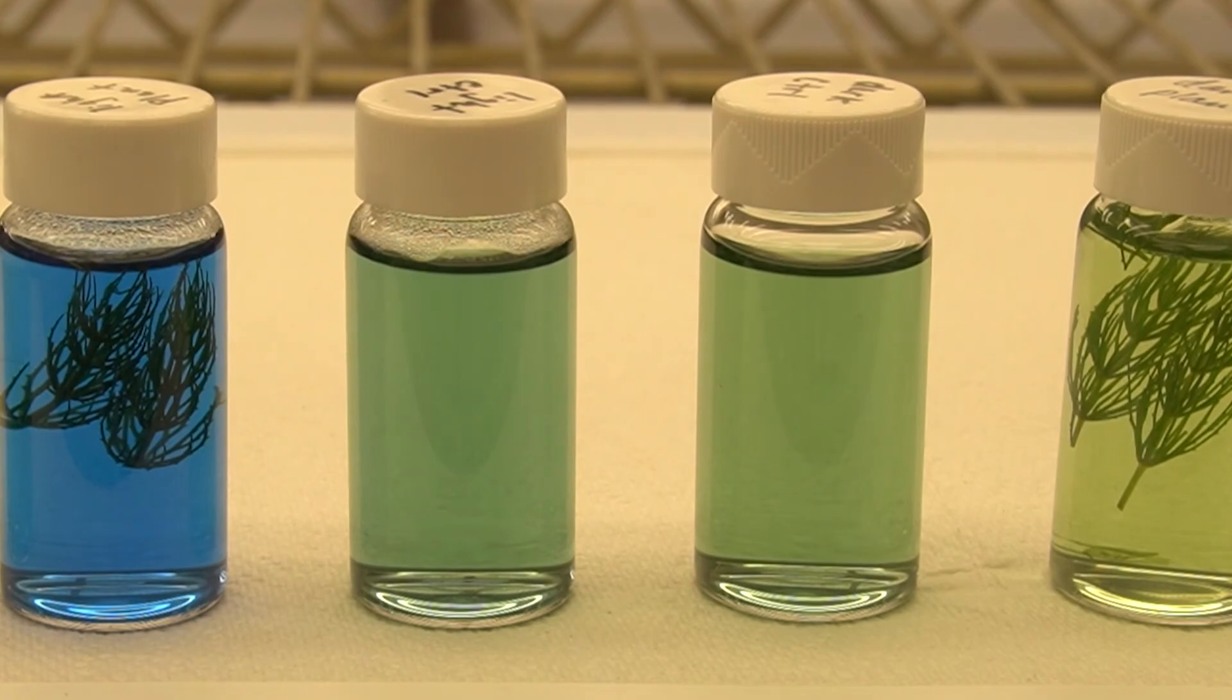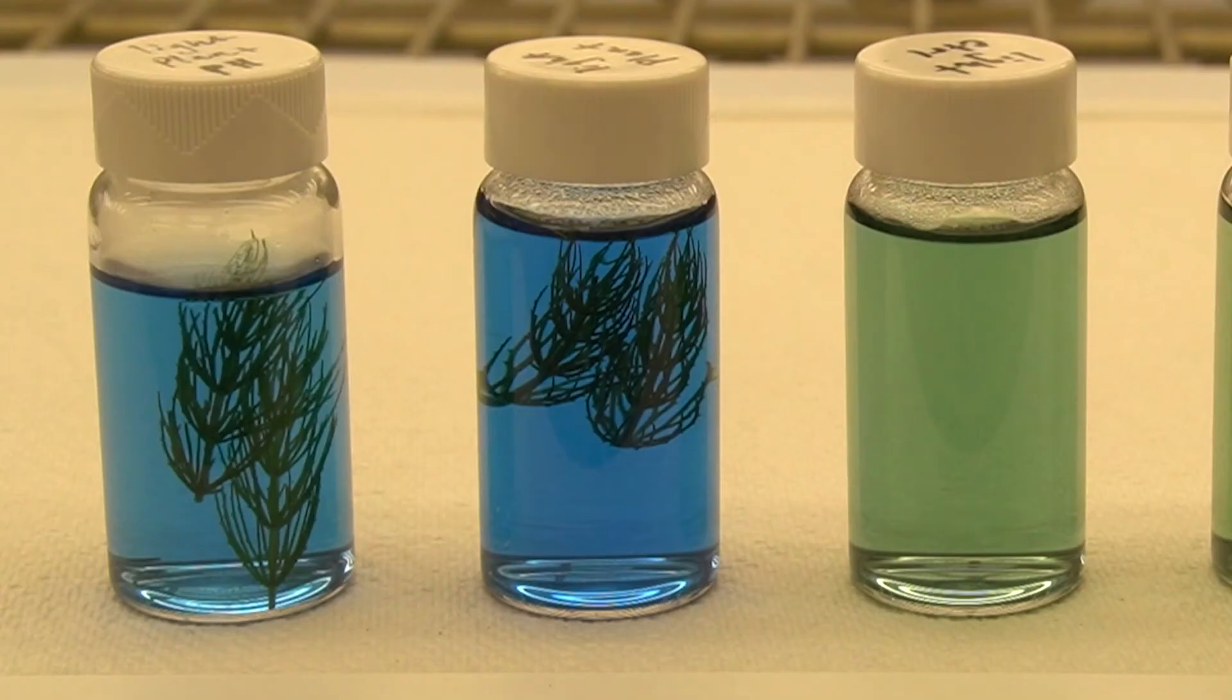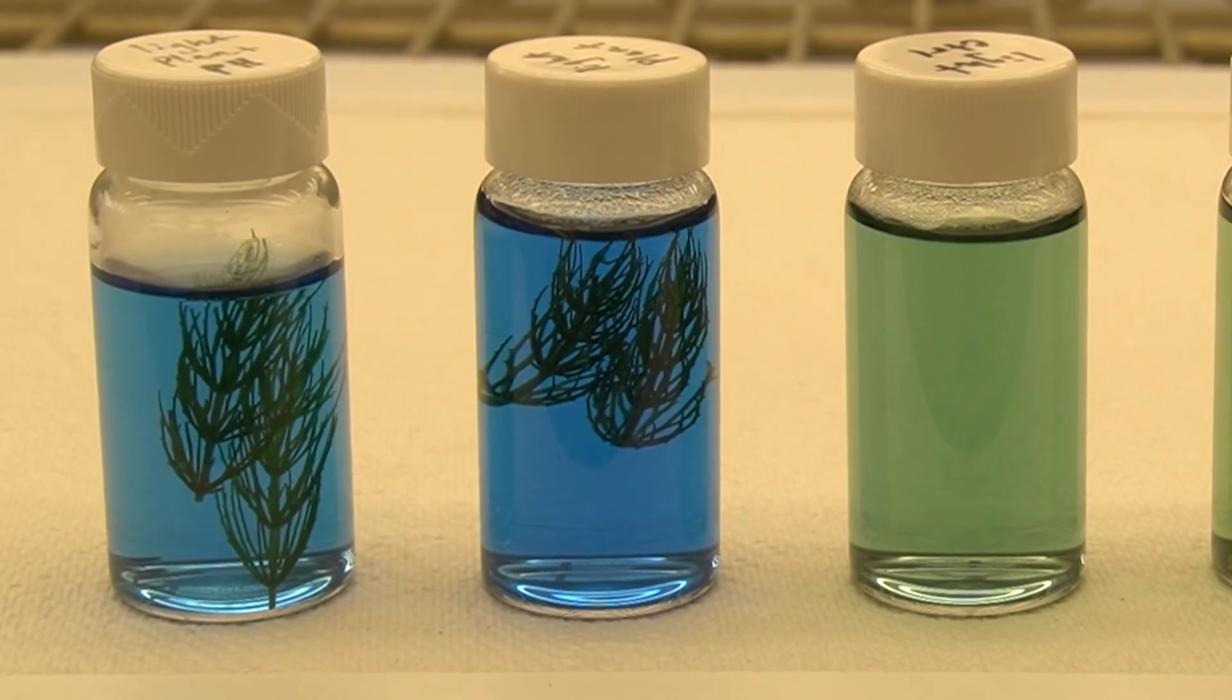Now let's interpret these results. How did they line up with your predictions? Let's start with the control vials. They're still the same general green color that they started out as, and that's because there isn't a plant inside that's dramatically changing the carbon dioxide concentration and therefore the pH of the water. So let's compare this with our experimental vials. The plant vials in the light underwent a major color shift from green to blue. Why? Well, the plants were photosynthesizing away and using up tons of carbon dioxide. Taking carbon dioxide out of the water makes it more basic, so the BTB turned blue.